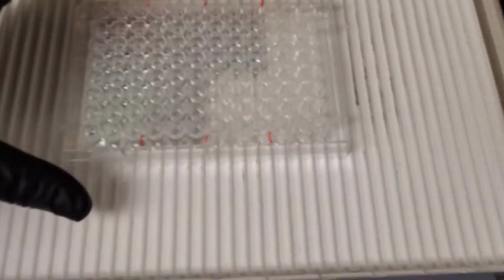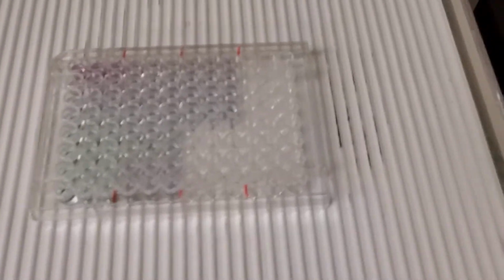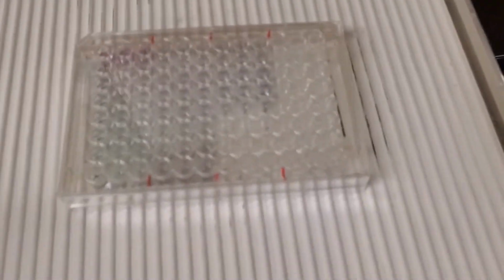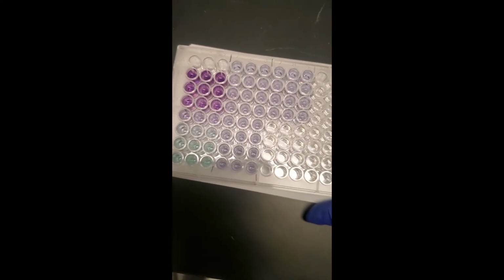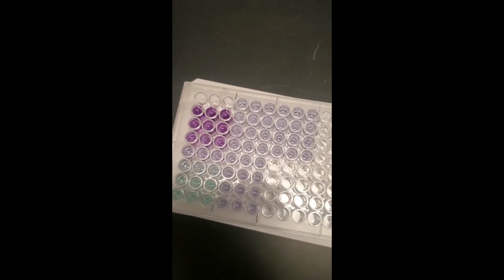My samples have been fully loaded. Now I just shake them a little bit for about a minute, cover them, and now I'm going to go ahead and put them in the 37-degree incubator for 30 minutes, and then I'll be ready to read my plate. So samples have been incubating for 30 minutes at 37, so it's done. I'm going to read it now.